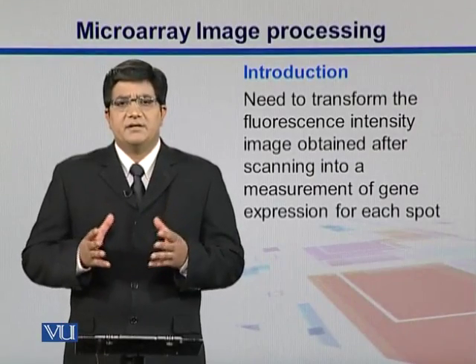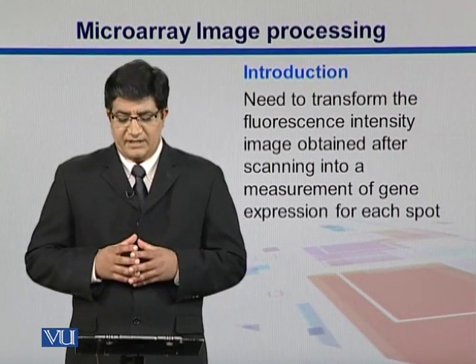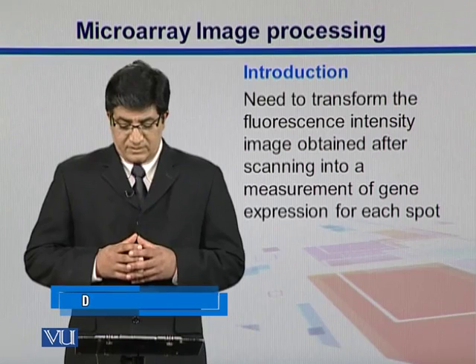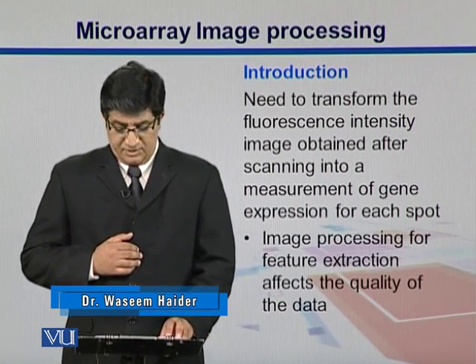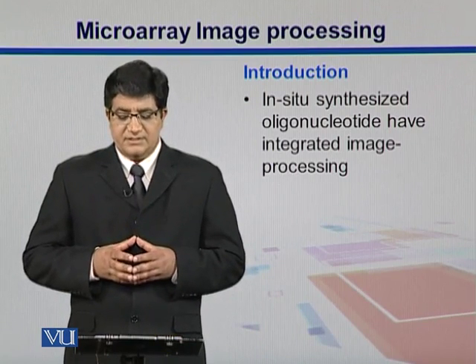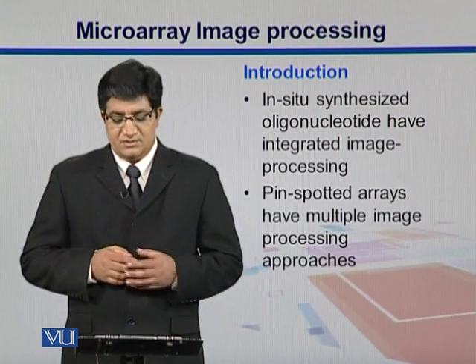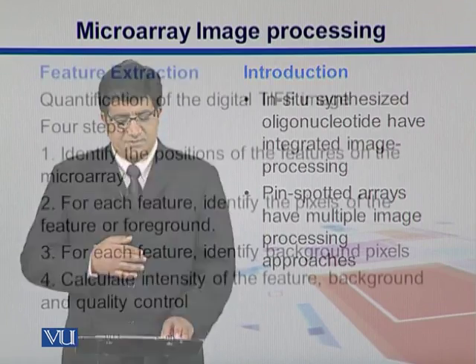So in microarray, we get some color images, so we need to do their scanning and we need to transform the fluorescence intensity image into a measurement of gene expression for each spot, and image processing for feature extraction affects the quality of the data. As far as those oligonucleotides are concerned, there is an integrated image processing approach, but in case of those pin spotted arrays there are multiple image processing approaches.